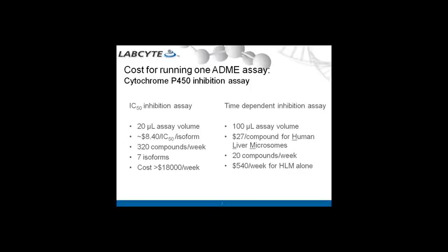There are many other ADME assays to evaluate drug absorption, distribution, metabolism, and elimination. The cost for running all of these assays with a large number of compounds will be astronomical. So one way to cut cost, we believe, is to reduce the assay volume.